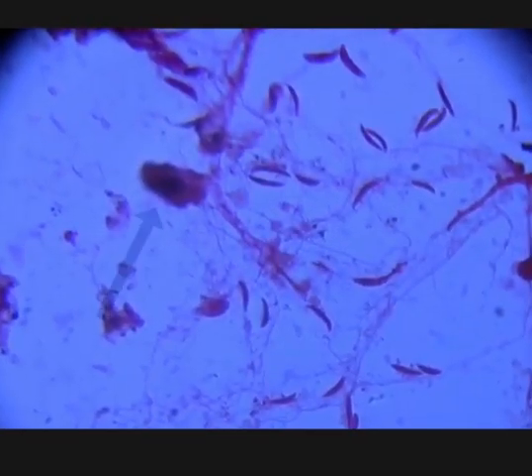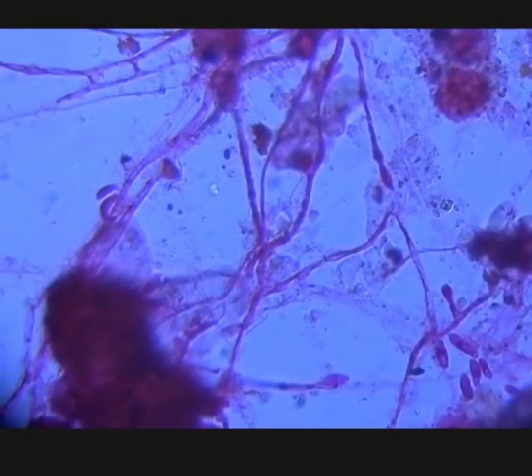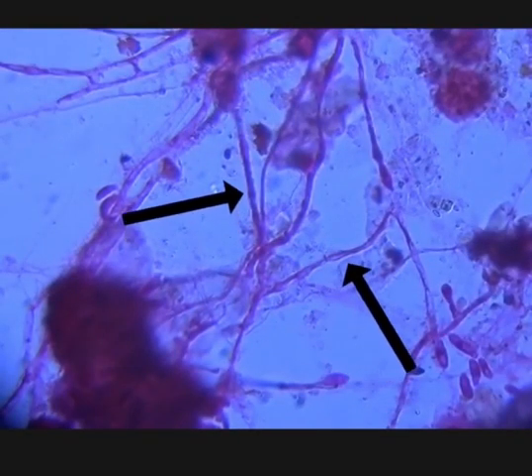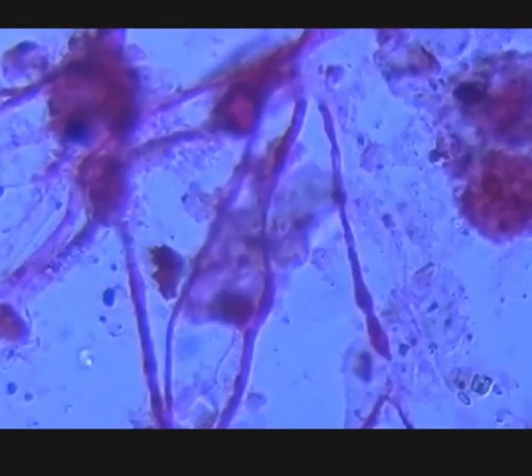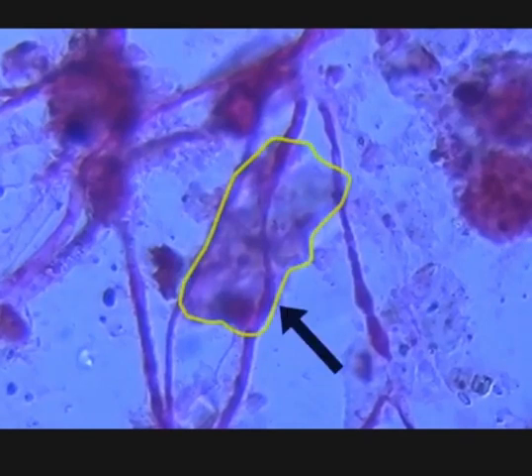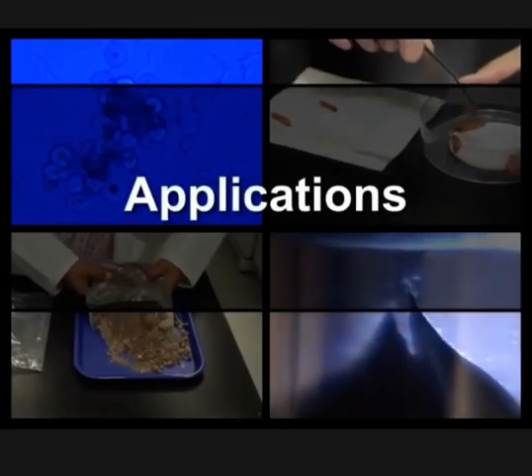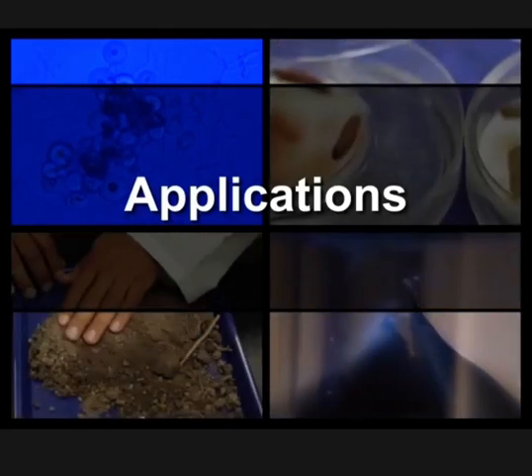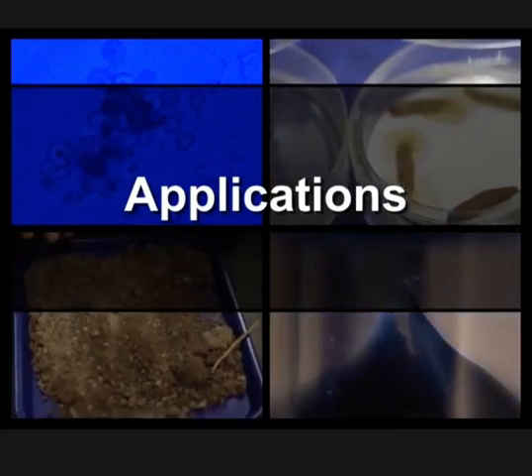Soil particles display dark, irregular shapes. Fungal organisms display thick filamentous hyphae, while actinomycetes display thin filamentous hyphae. Bacteria are found as small cocci or rod shapes, typically in clumps, on soil particles or lining fungal hyphae. The direct isolation of organisms from soil is important to the understanding of soil and environment characteristics.